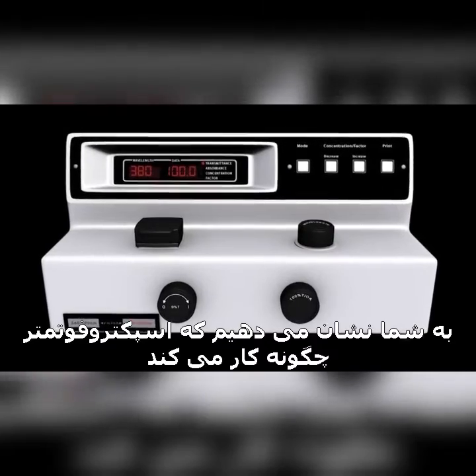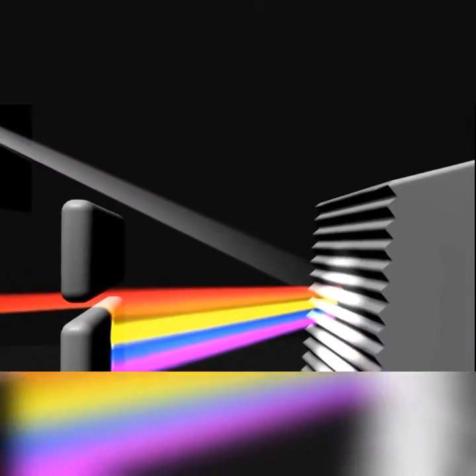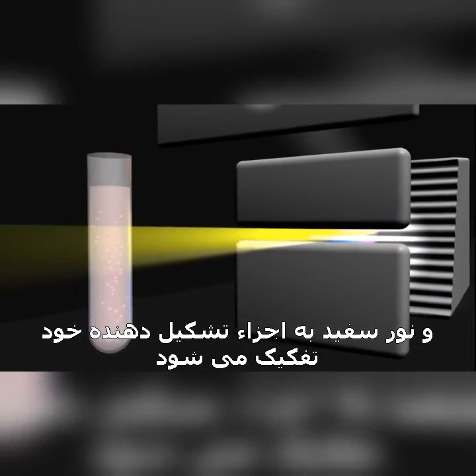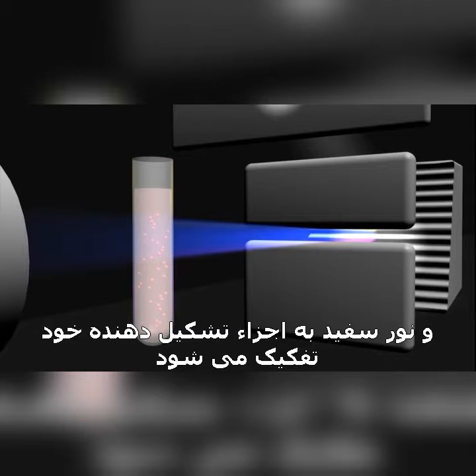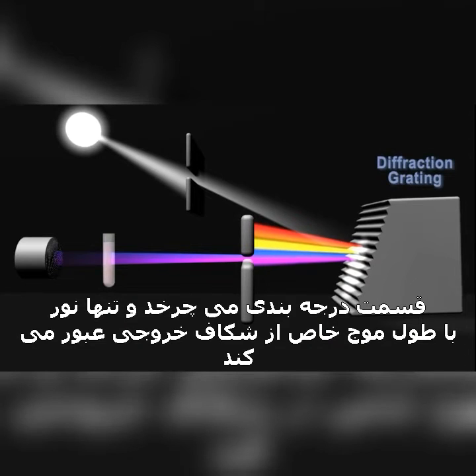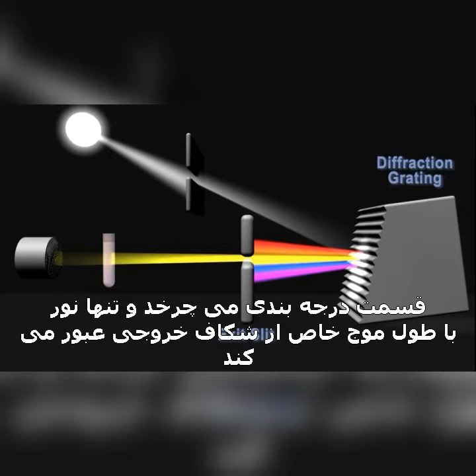Here's how a spectrophotometer works. A lamp provides the source of light. The beam of light strikes the diffraction grating, which works like a prism, and separates the light into its component wavelengths. The grating is rotated so that only a specific wavelength of light reaches the exit slit.